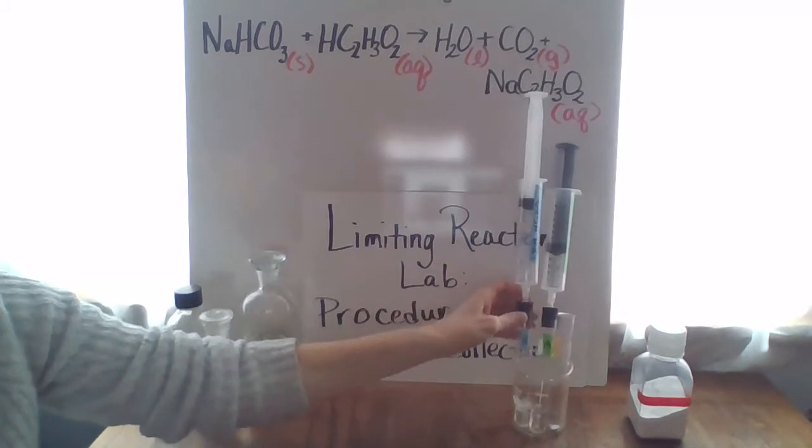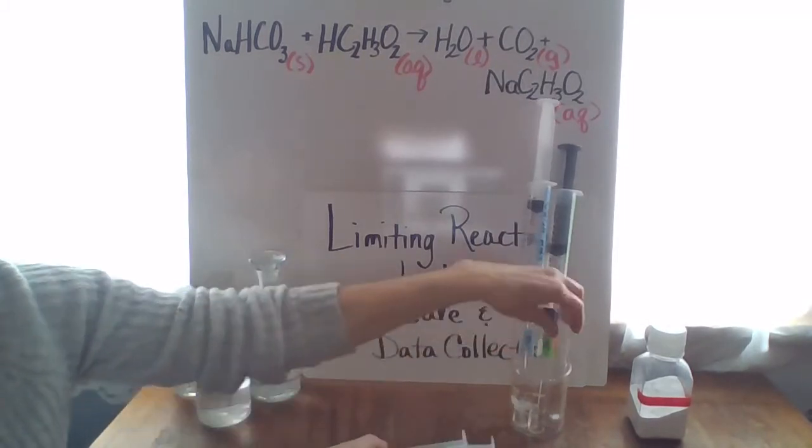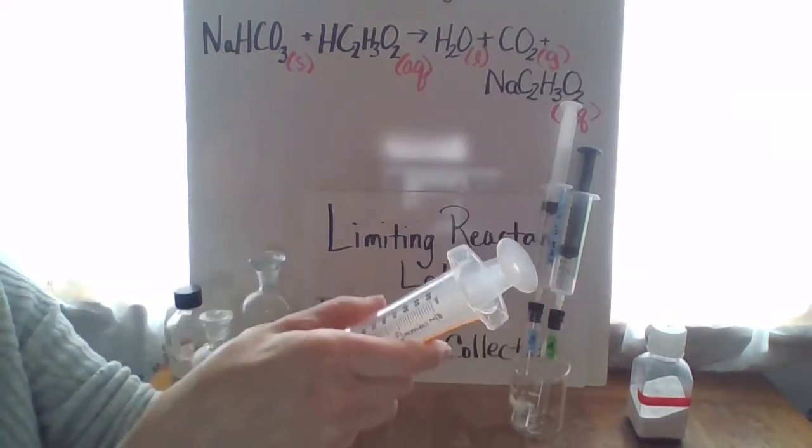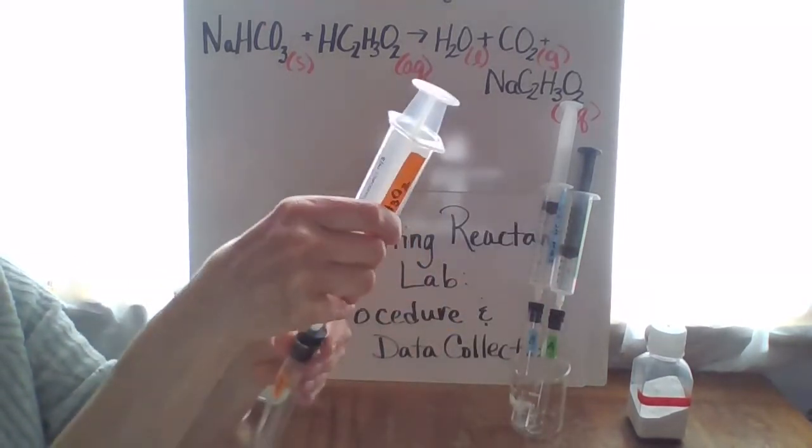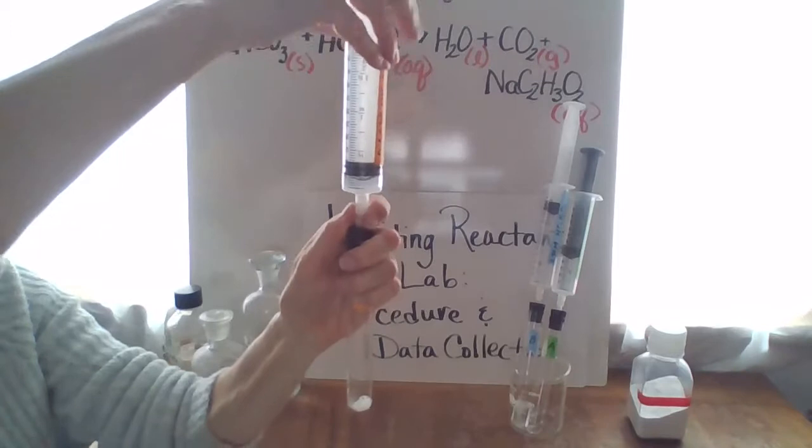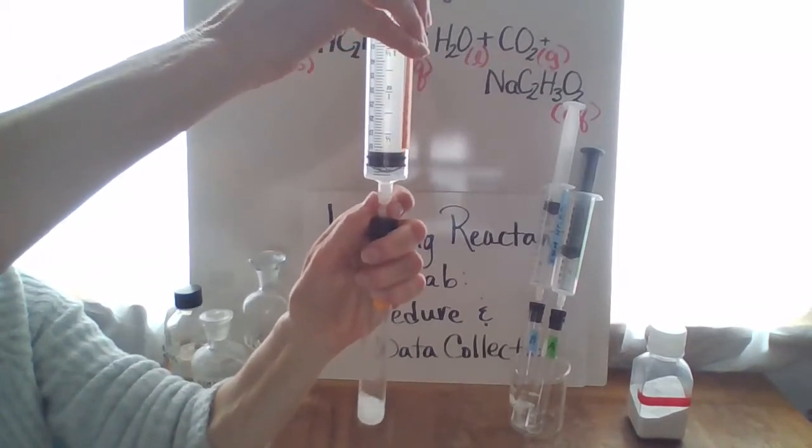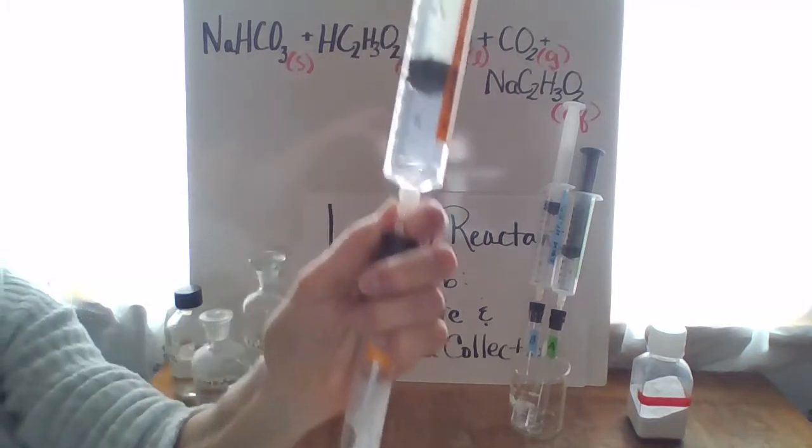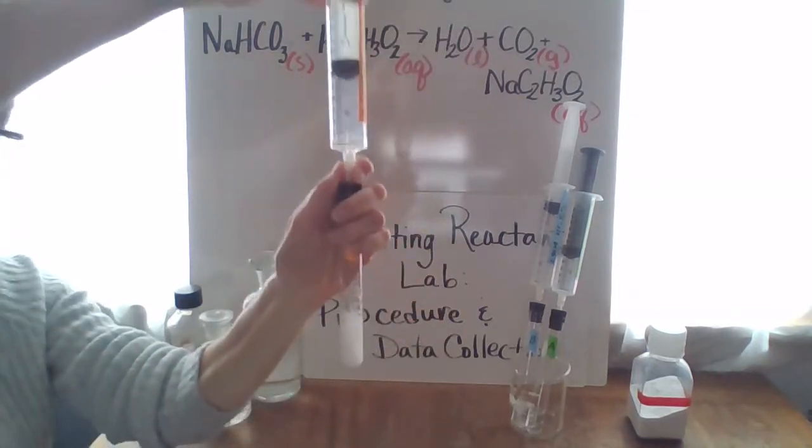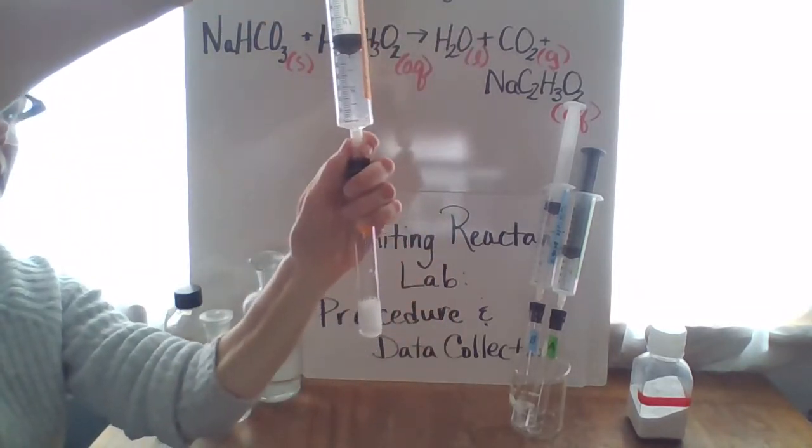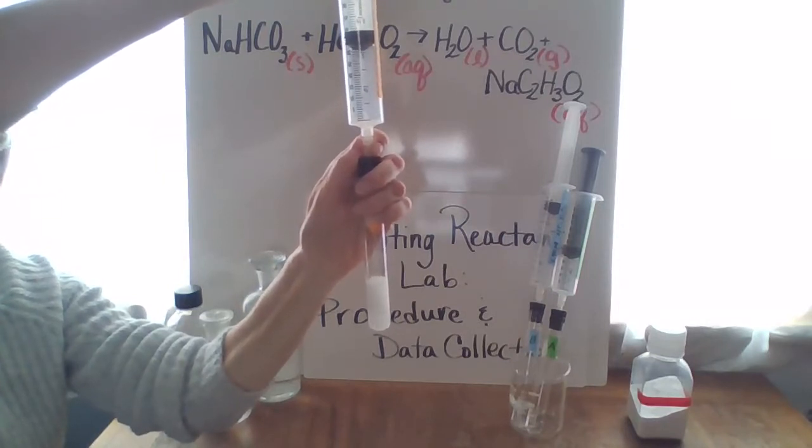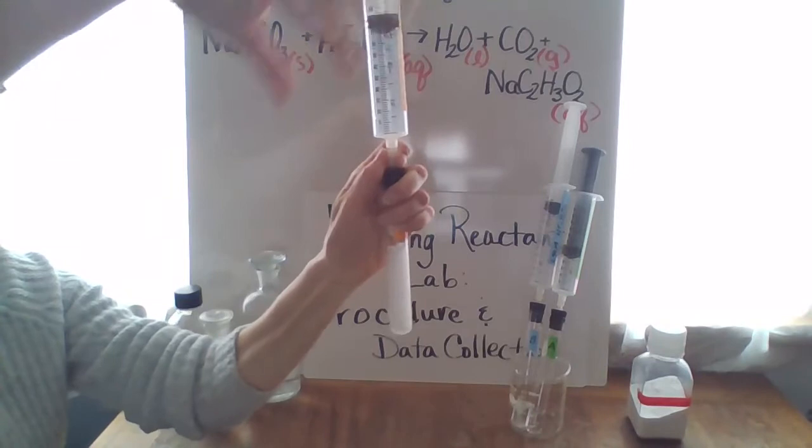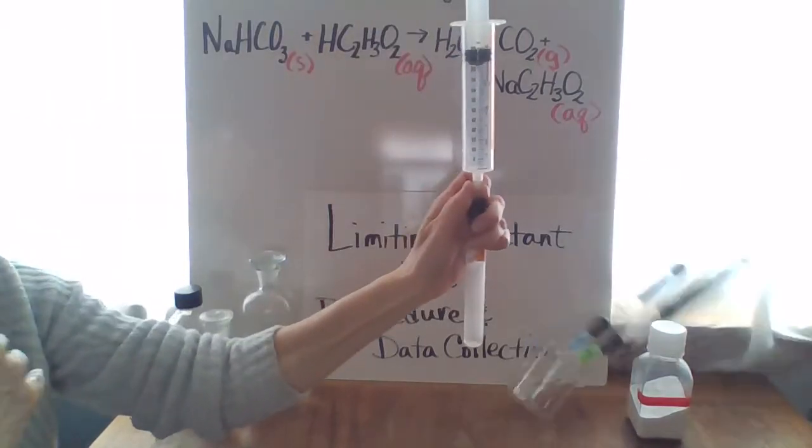And then we'll do the third one, reaction C, with the 0.6 molar reactant acetic acid. Again, see quite a response here. We've got all the acetic acid into the reaction vessel and allow that plunger then react.